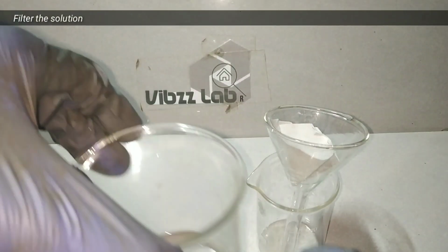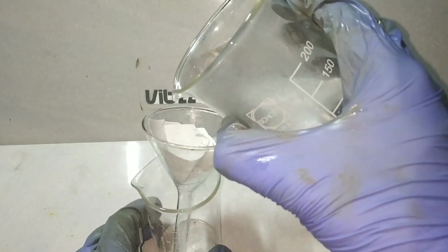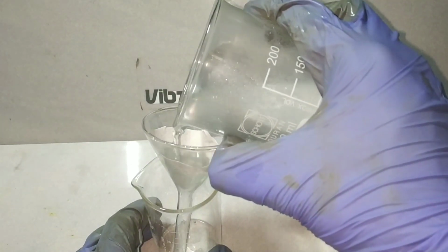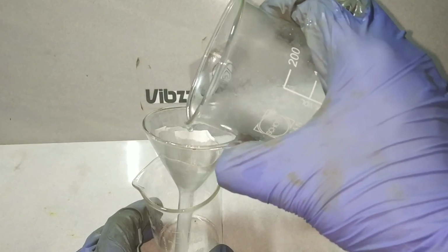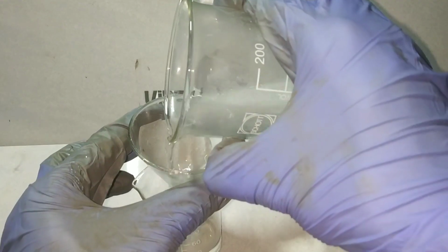Next we will be filtering the solution to remove any undissolved particles. I am using a gravity filtration method and that will be sufficient as there aren't many particles to clog the filter paper and block the filtration.